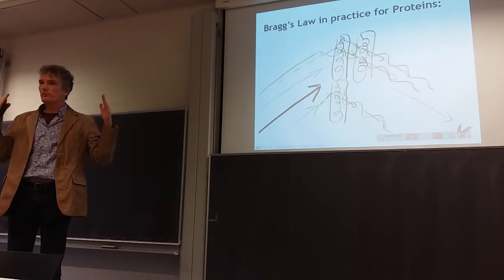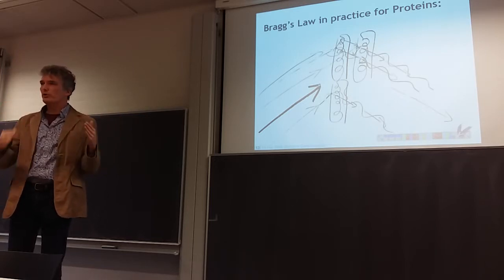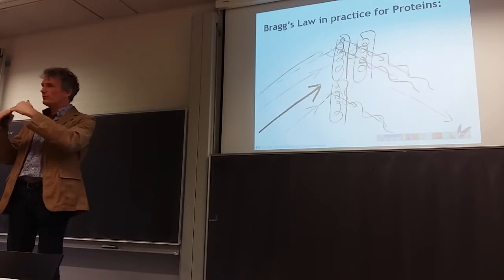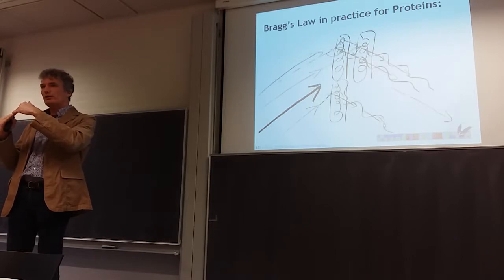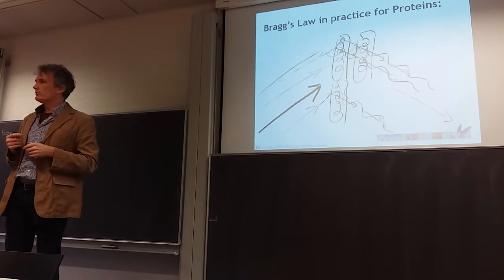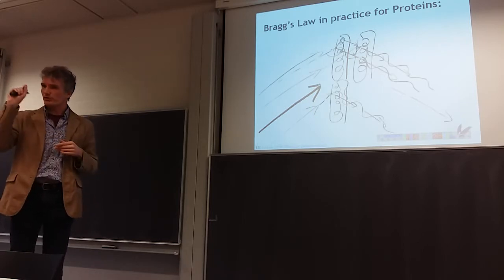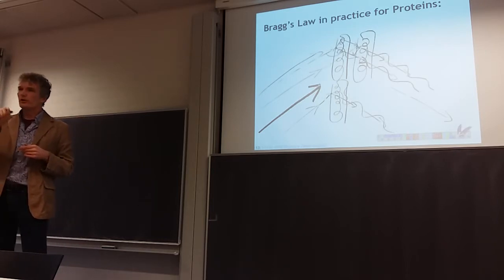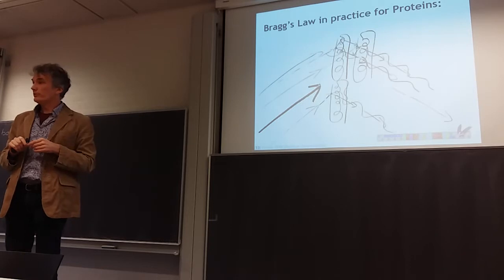Right? So now you should imagine that you have millions of secondary beams coming off in a particular direction, and only in some directions do they all line up. If you get the directions slightly off, then they will be randomized and they add up to 0. So that's why you get these precise spots in some locations and nothing next to it, and then another spot a little bit further on.